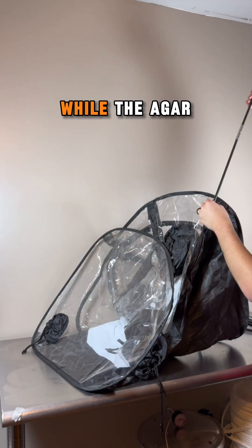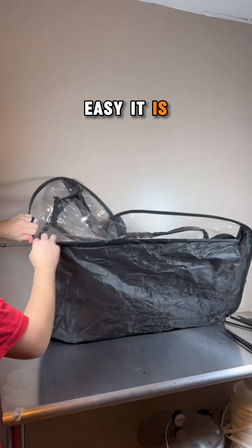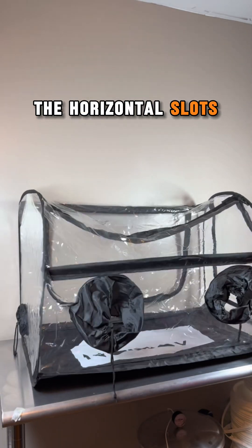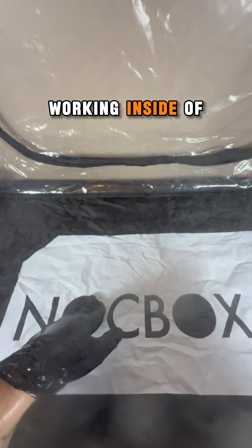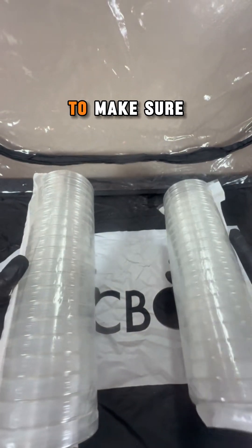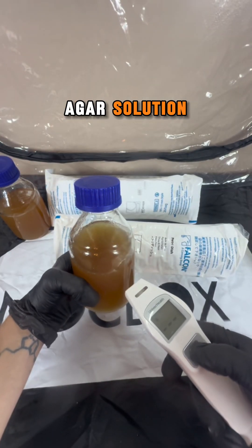While the agar solution is cooling down, I set up the NocBox by North Spore. I love how easy it is to set up — just using tent poles, all you have to do is slide them into the horizontal slots and it's ready to go. It creates a still air environment where no airborne contaminants can land while you are working inside of it. The most important part is to spray every inch inside the NocBox with isopropyl alcohol to make sure it's clean before working.